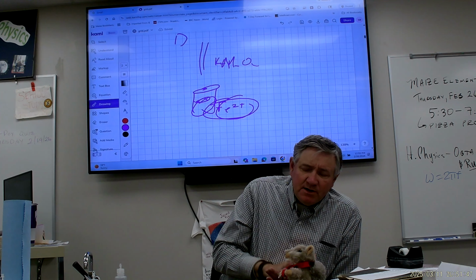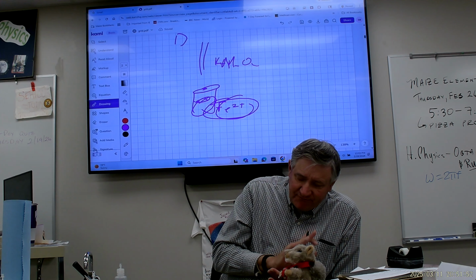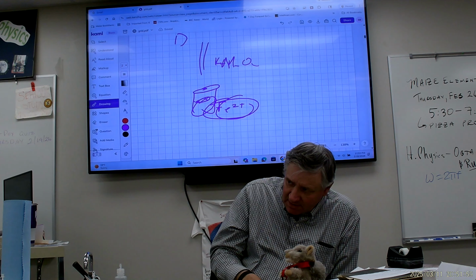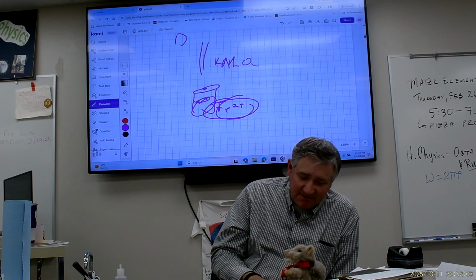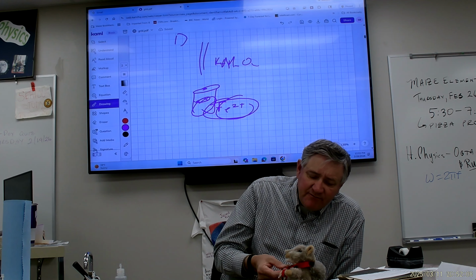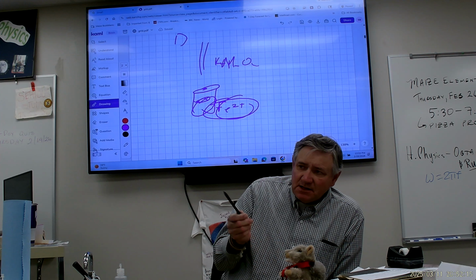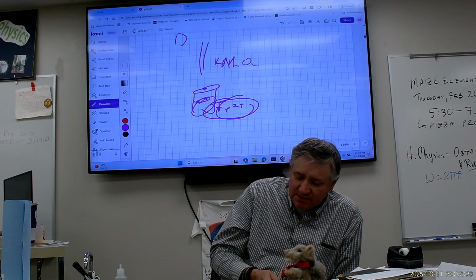Now, here's what you're going to do today. Now, you're going to try and find the molarity of oxalic acid. So down there on part 2, I've given you the formula for oxalic acid. Strong acid, weak acid? It's a weak acid, okay? Never heard of it, okay? It's very much a weak acid. So I've given you in here the half reaction for the oxidation of oxalic acid because it's not on any of your sheets, okay? So I've given you the oxidation.